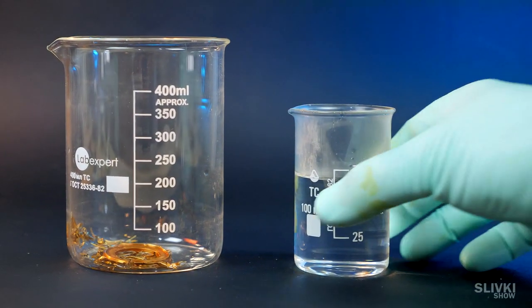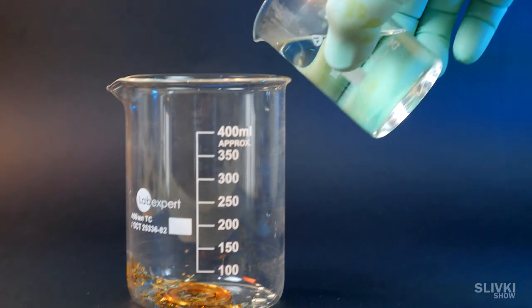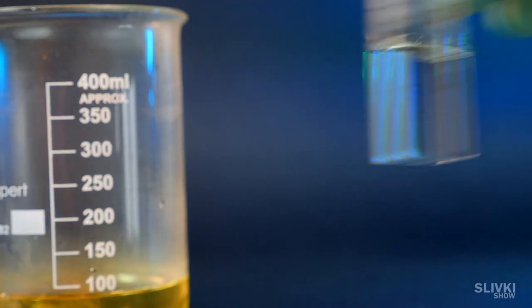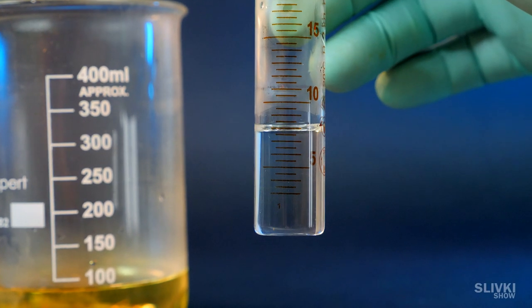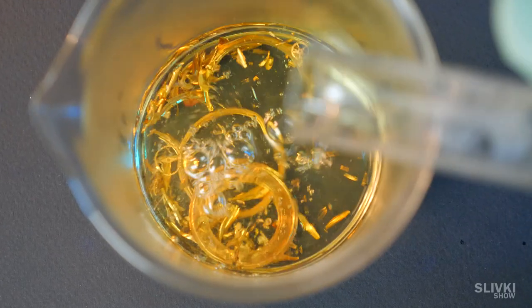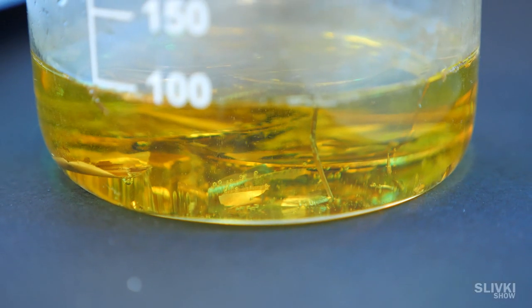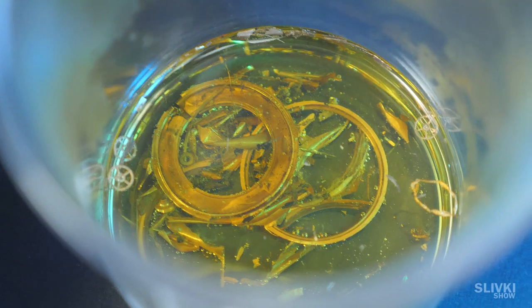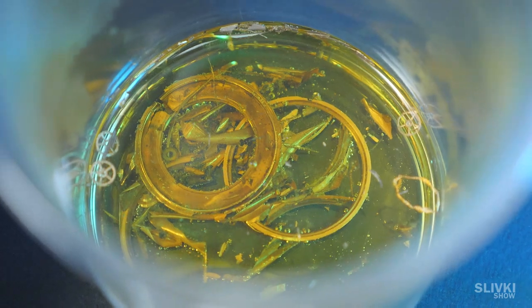Then we took about 70 ml of hydrochloric acid and poured it to the gold. After that, we added another 70 ml of nitric acid. This mixture of acids has even more power of dissolving metals, and it can dissolve even our gold.